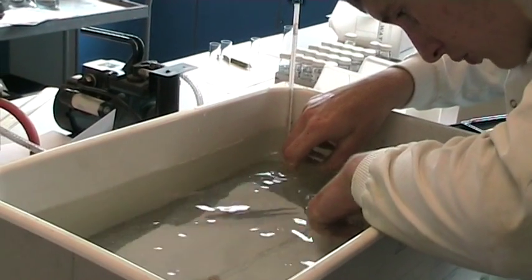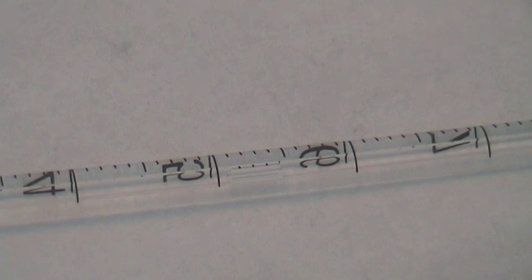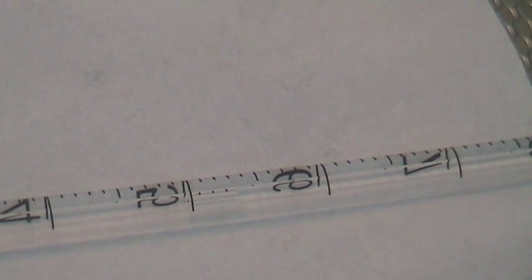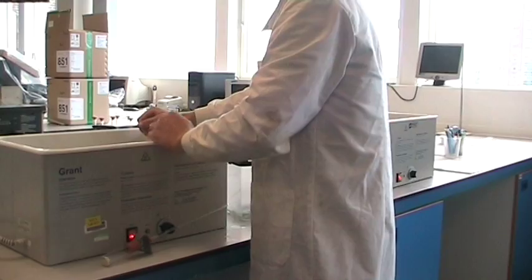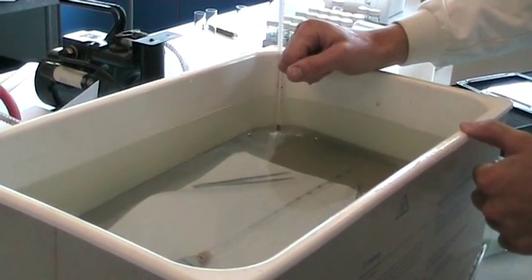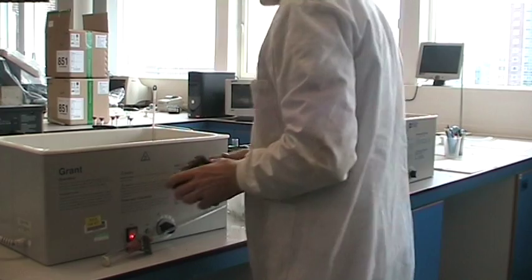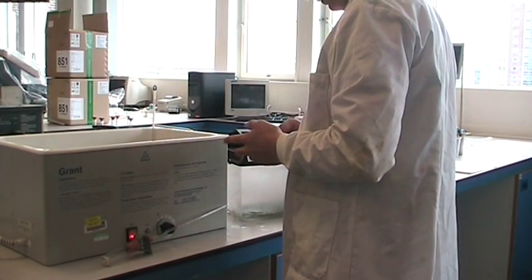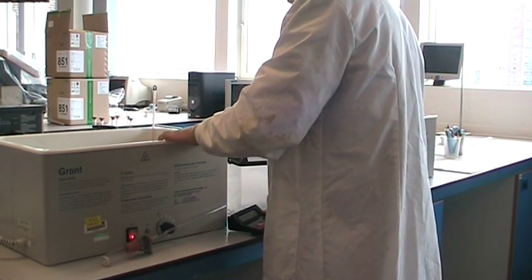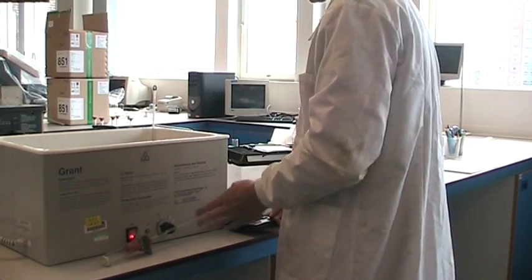there's a small meniscus. Water is drawn into the tube as the CO2 is absorbed by the soda lime. So the amount of water that is drawn into the tube is the same as the amount of oxygen used by the locust in respiration. You would then time it for 30 minutes, taking a reading of how far along the tube the meniscus has moved. You'd record it every minute.